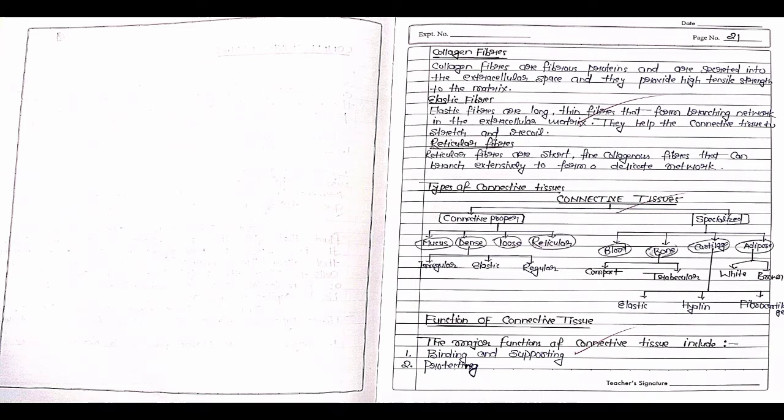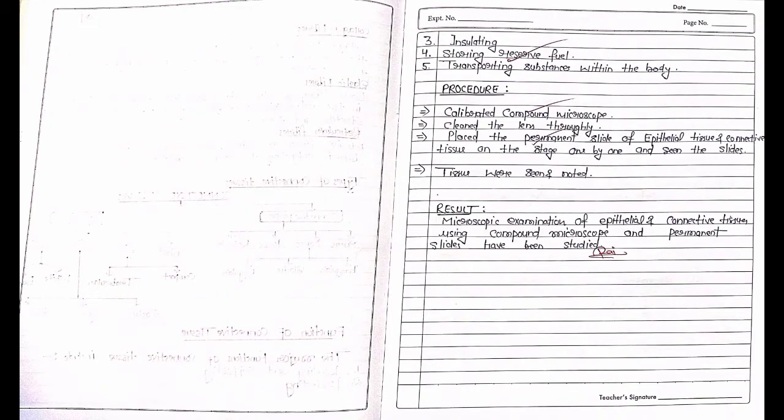Three types of fibers are found in connective tissue: collagen fiber, elastic fiber, and reticular fibers. Then we see the types of connective tissue and their functions. After that we see the procedure. The procedures are: first, calibrate the compound microscope.